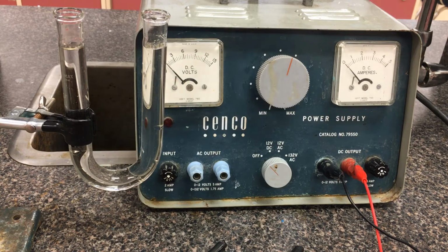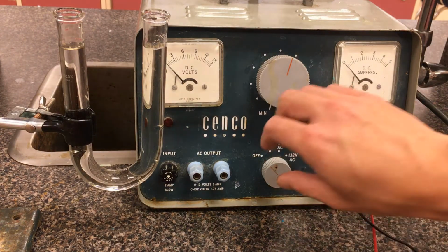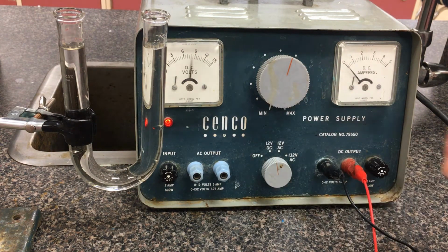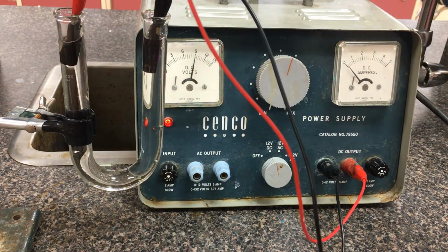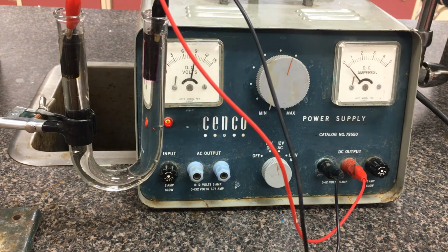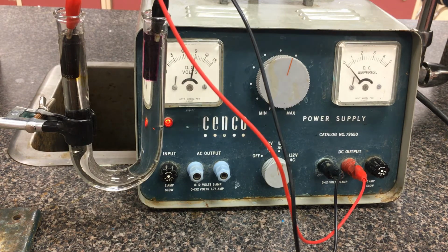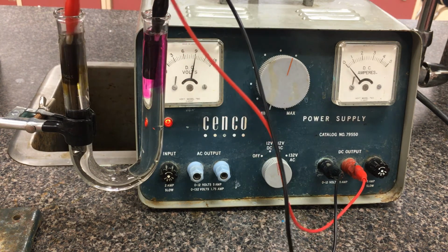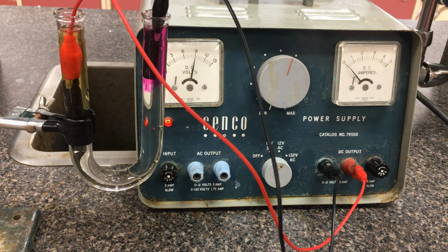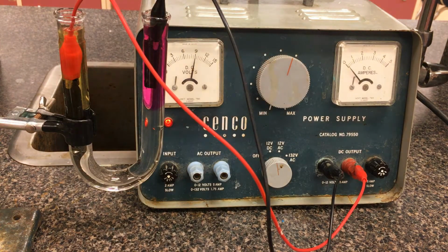I already have my voltage set to do 9 volts, but I do need to flip it on. I'll keep these carbon electrodes separate from each other. I'm going to turn it on, and then we're going to make some observations of what happens. Let's just drop one lead on the one side. We'll drop the other carbon electrode on the other side. Shake it up a little bit so you can see a little better. See if, based on those physical observations, you can predict what's being formed at each electrode.